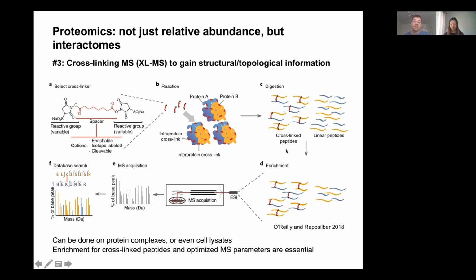There is really nice software for selecting for these cross-linked peptides, but it is difficult to enrich for them. I will just say that. There are a few cross-linkers that have useful features like biotin moieties in them, so you can do a similar enrichment to the last step. Then after searching, with a technique like this, you can hopefully gain an idea of where proteins are actually binding in an unbiased way, and you can do this in a whole cell lysate.